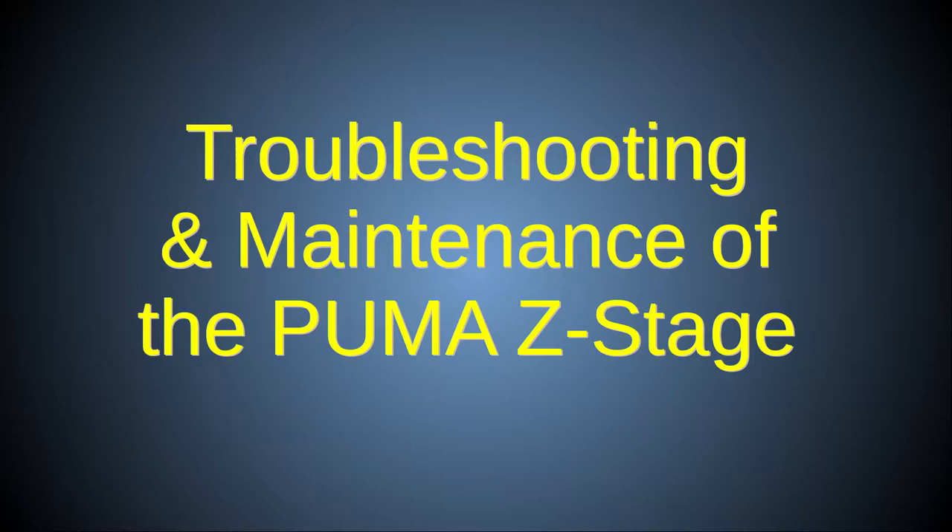In the first Z-stage video I showed you how to construct the Z-stage. In this video I'll give advice about troubleshooting common problems and the maintenance procedures required to correct and prevent them.